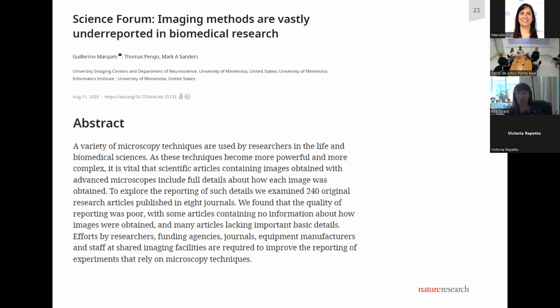So first off, how good is microscopy reporting? Is there a problem? Or are people doing it right already? So there was this really fantastic paper, not the first of its kind, but it got a good amount of attention. It came out in eLife 2 years ago. And basically, these authors looked at 240 papers in 8 different journals and just said, how good is the microscopy reporting? And long story short, not very good.